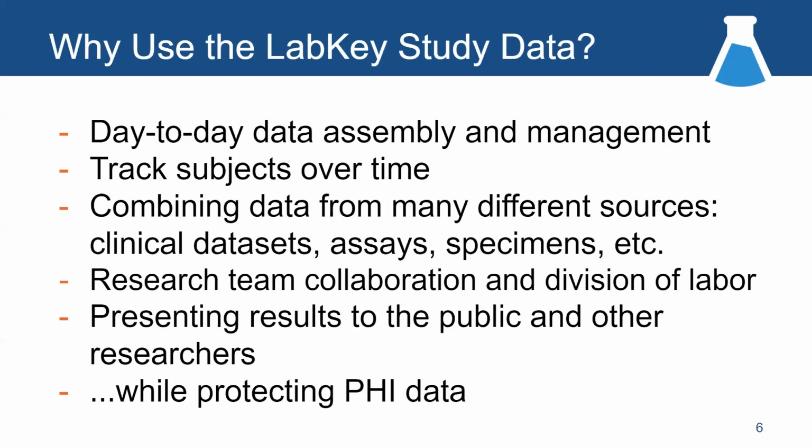Also, anytime you are tracking subjects over time, the LabKey Study features are a great choice. All of these studies, this kind of research work involves ultimately tracking performance of some subject or some participant over time.